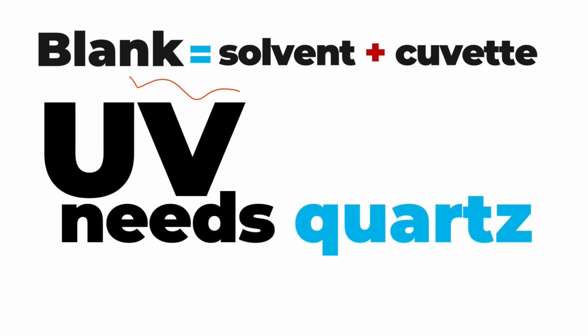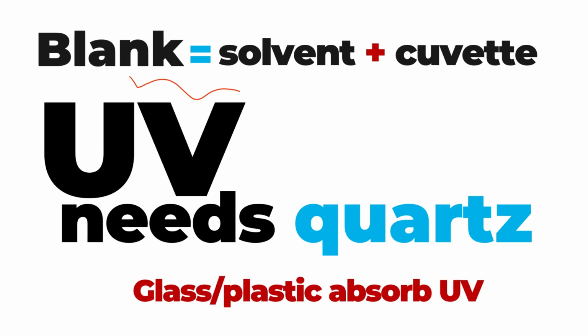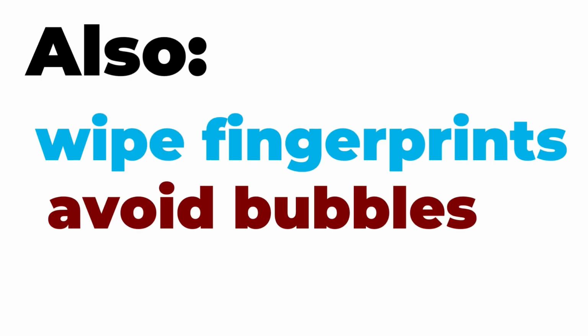If you scan UV, use quartz. Glass or plastic can absorb UV and distort everything. Also wipe fingerprints, avoid bubbles.